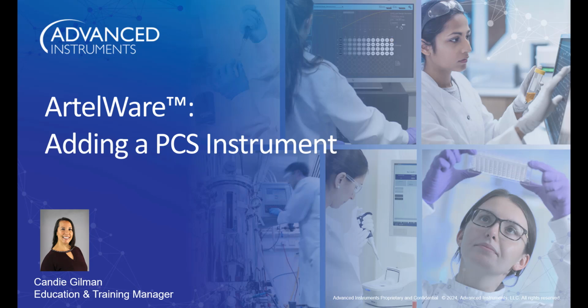Thank you for joining me for this brief tutorial focused on adding a PCS instrument into the ArtelWare application. Let's go ahead and get started.